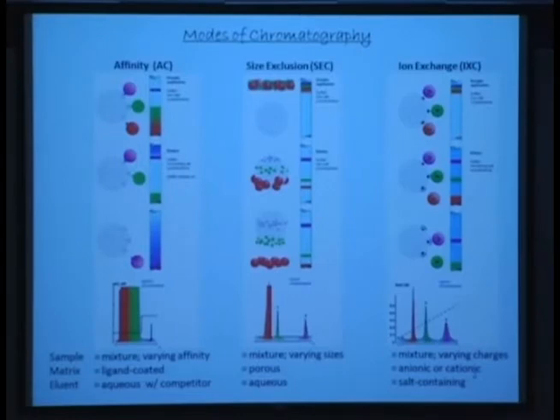Okay, so this is a fairly powerful tool for purification purposes, and is one of the ones that has high resolution, and one of the ones wherein even if you have 1,000-fold greater amount of the non-binding component, you will still be able to identify this. Very, very few techniques would be able to do it. Okay, that you would be able to pick out even minor components. All right, clear? Let's move on.